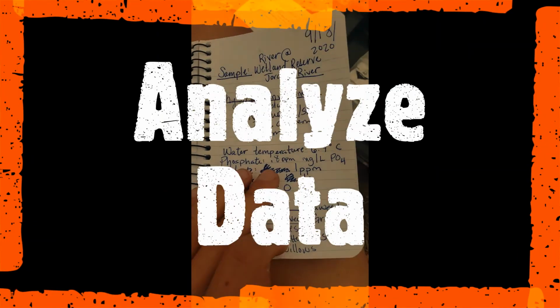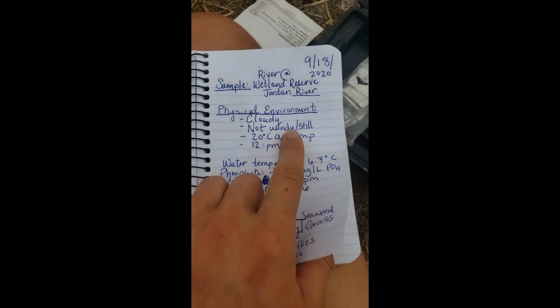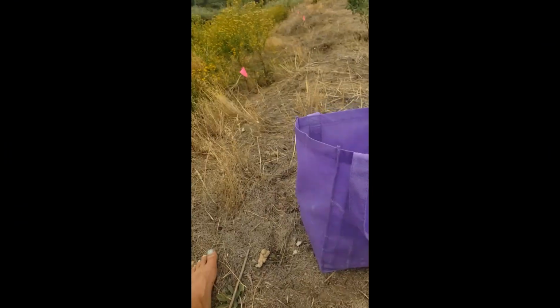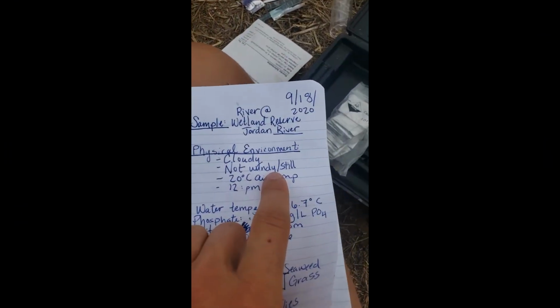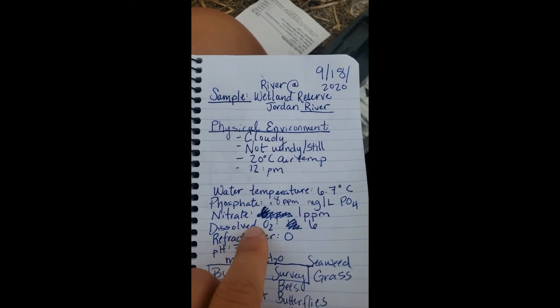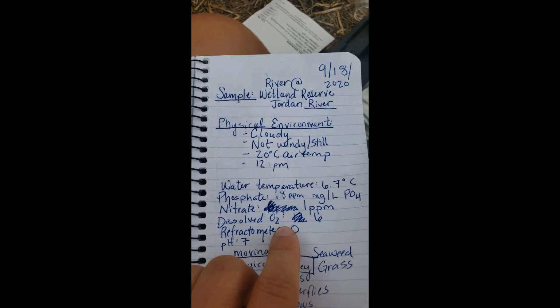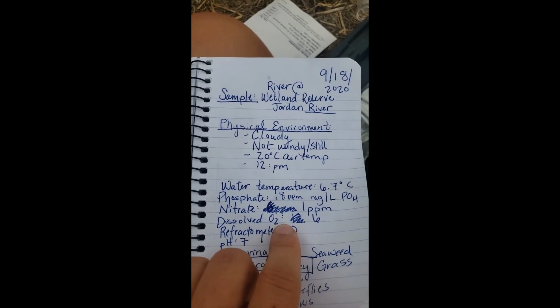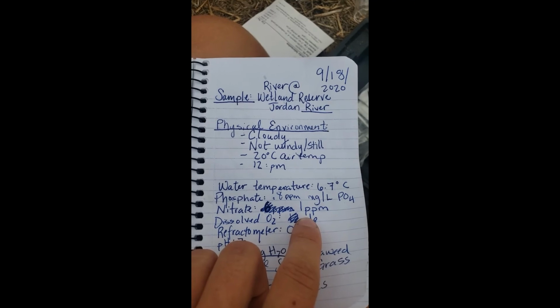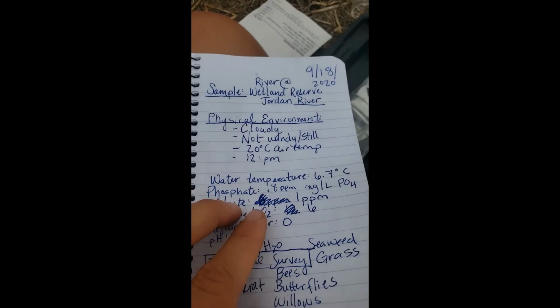Okay, so now taking a look at all the data we collected, we know that today was cloudy. It's starting to pick up a little bit windier now, so I wonder if that would cause different dissolved oxygen. Sometimes when there's more wind, more oxygen gets incorporated into the river. But as it was, we found that the water temperature was a little bit warmer in the pond.